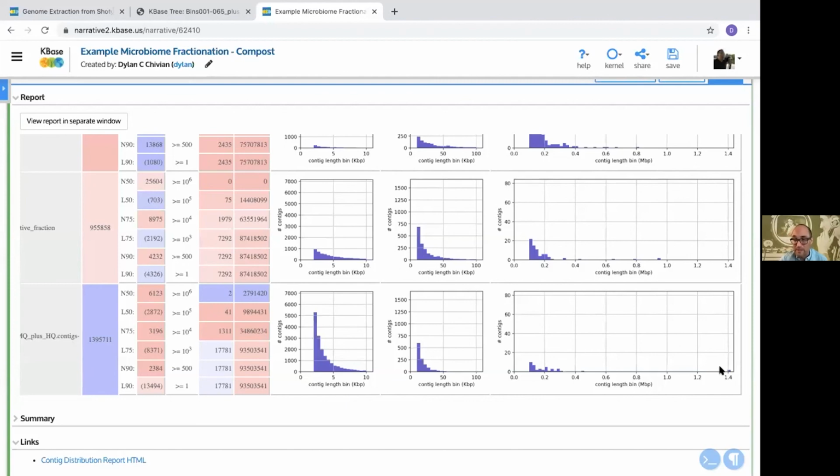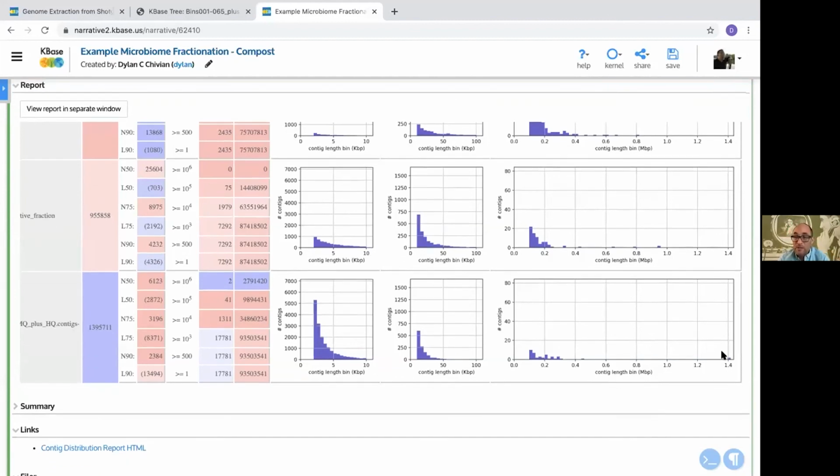It's possible that it exceeded the contamination threshold. I would want to pull that one out and run that through CheckM by itself and see what happened there. So it may be a contamination issue, or it may be that it wound up being a standalone.